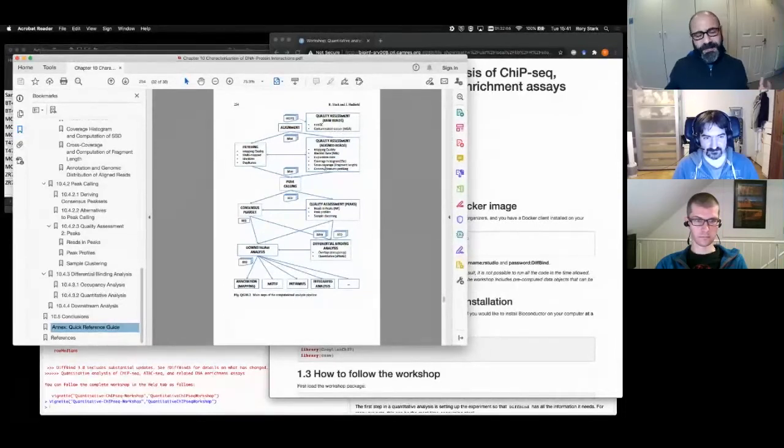Now the next issue, the big issue in doing a differential analysis, is there's a bunch of tools, a lot of styles, but within the Bioconductor world, I would say there's really two, as evidenced by publications in the last 18 months, that is published analyses. There's two tools that are used the most.